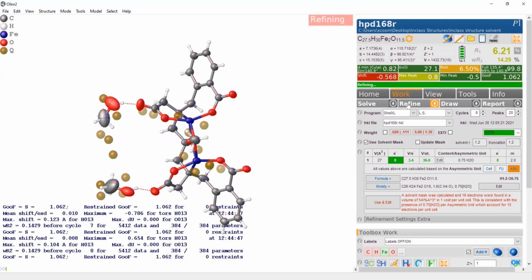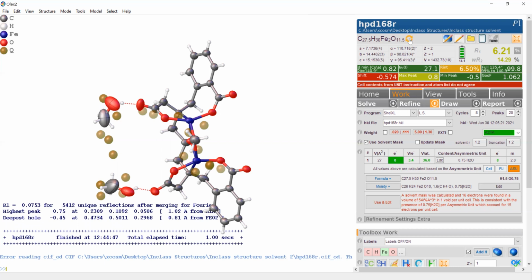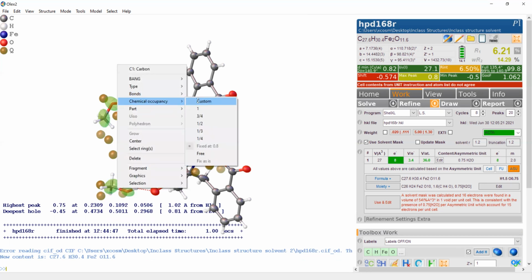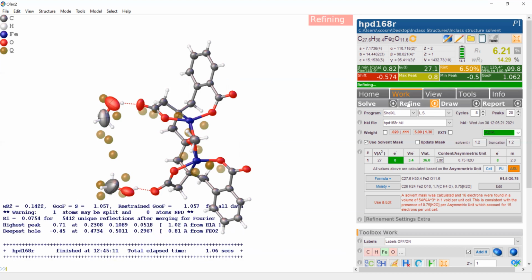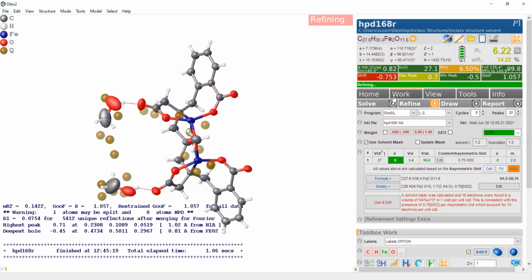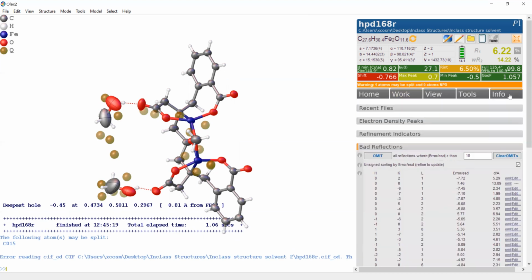Not quite, not quite. Close though, close. Let's try 85%. Let's try 70%.